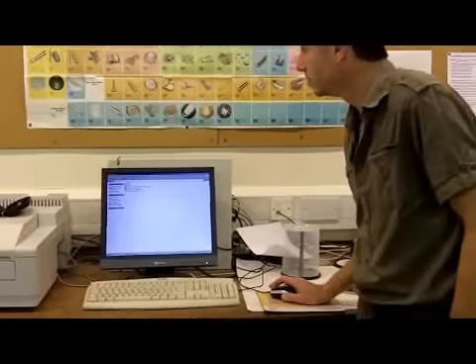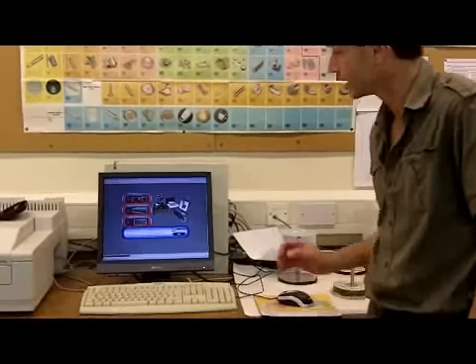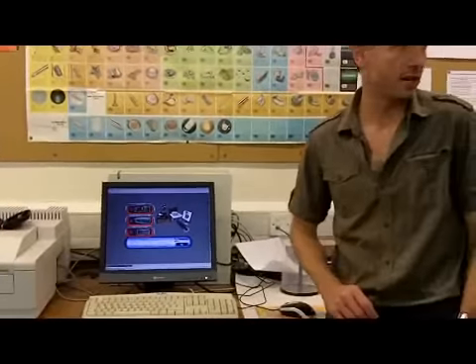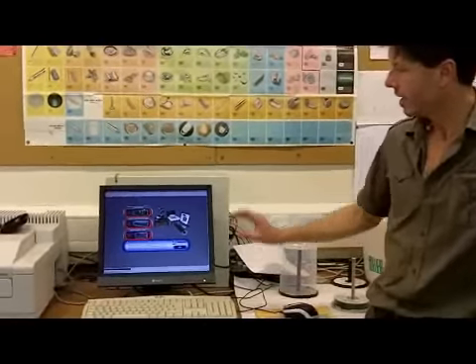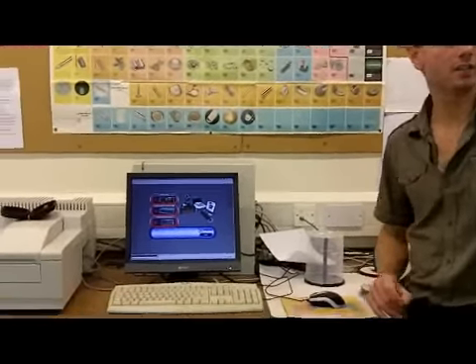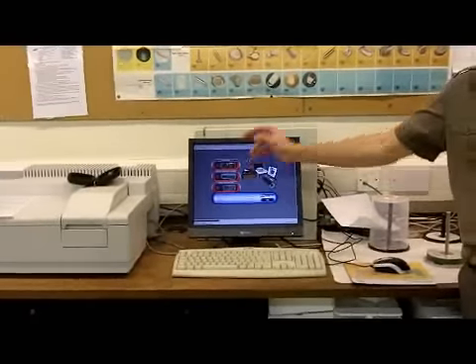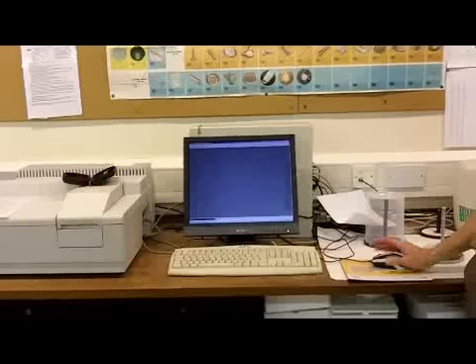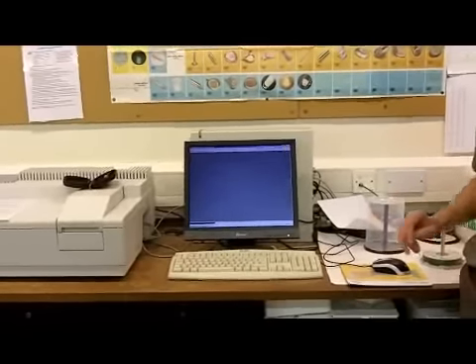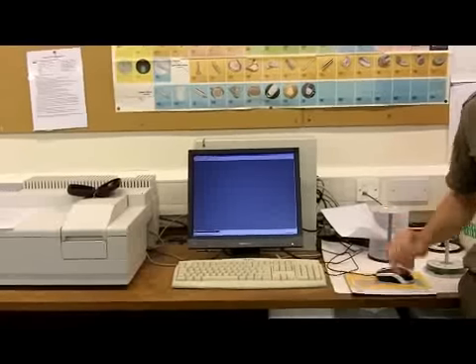Okay, so we open that directory and run the executable, and we get this screen, which is the entrance screen. The program is designed to run STM microscopes as well, and that's what this bit is about. It's looking for the control systems. It can't find them, and you say OK. And now it uses the standard Windows type interface to open and close files.